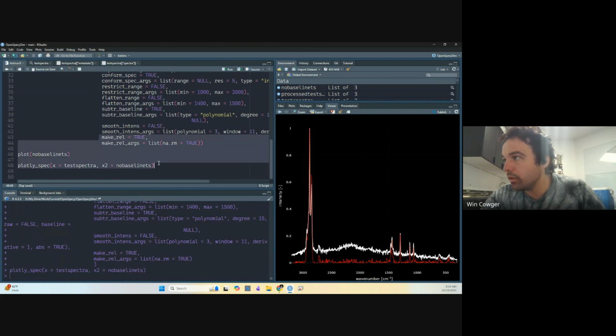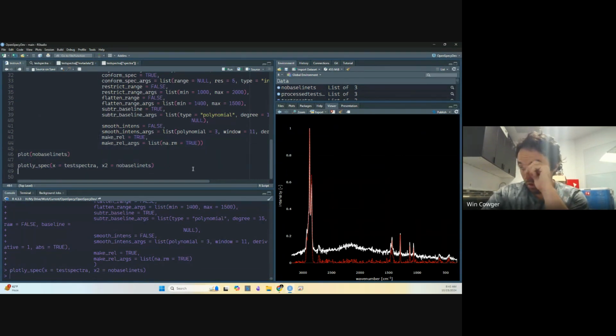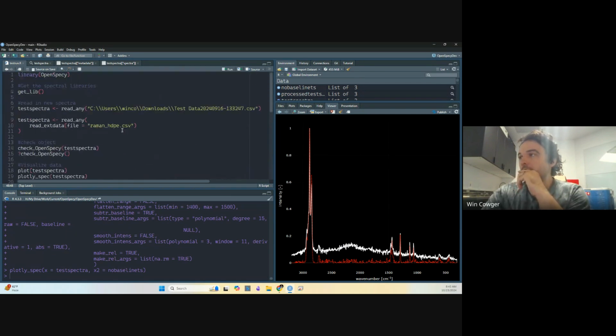True. Okay, we're getting close. I think I got everything in there. So you just have to copy them through and then paste them all together. But hopefully those will work if you're getting lost at all.